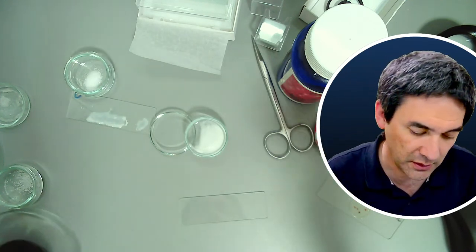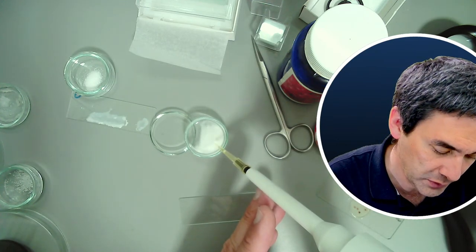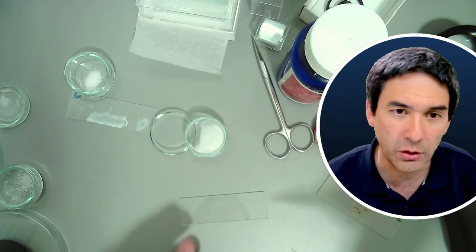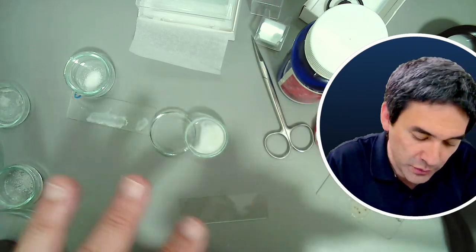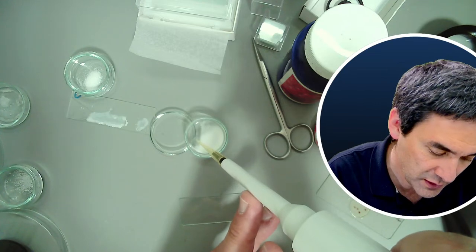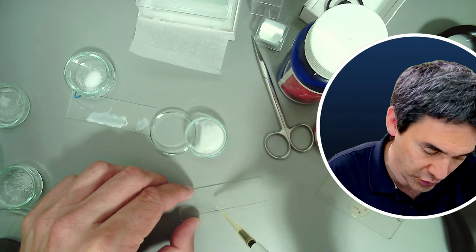So I'll now take a small sample from the top and put it here. And what's going to happen is, because alcohol has a very low surface tension, it's going to spread very quickly across the slide, which is fine. It's actually nice because it gives you a nice large area.